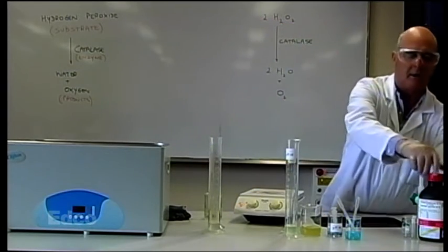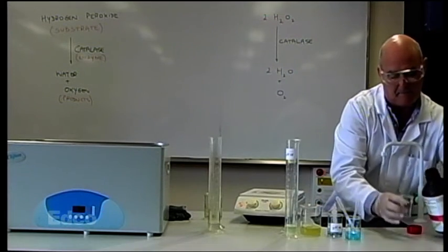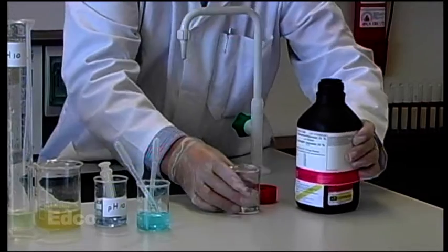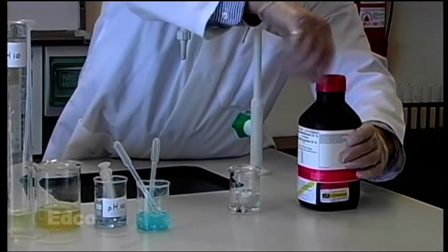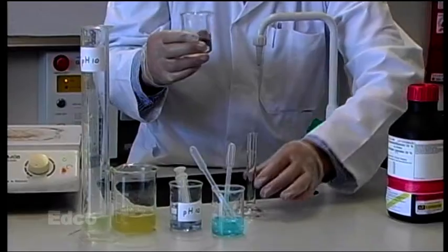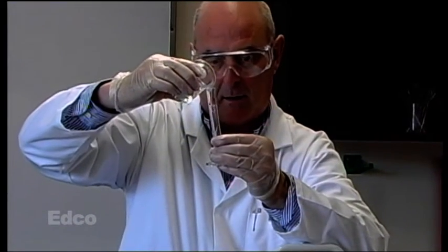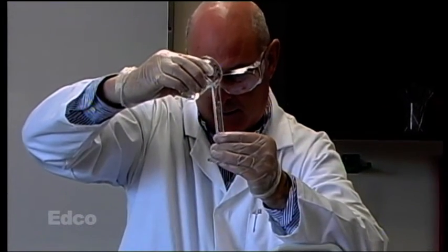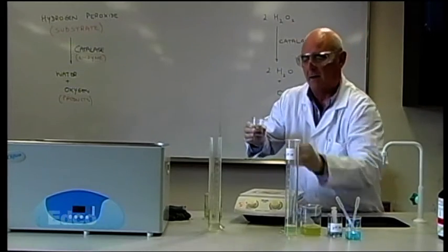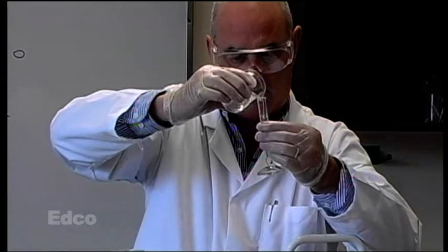Again, hydrogen peroxide is dangerous, so wearing gloves and goggles for safety. And transfer the hydrogen peroxide into a beaker first. And we pour 5 cubic centimeters of hydrogen peroxide into the small graduated cylinder. And also 5 cubic centimeters into the second graduated cylinder.